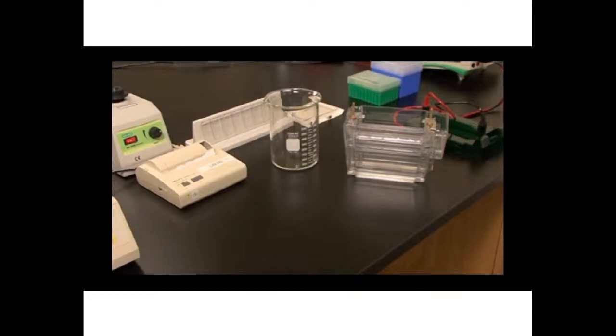Bio-Rad offers many different staining choices for 2D gels, ranging from the visual stains, the traditional Coomassie and silver stains, to the fluorescent stains, Flamingo and Sypro. In this case, I am staining this gel with BioSafe Coomassie, and the first step requires 3 10-minute rinses in water to remove SDS from the gel.